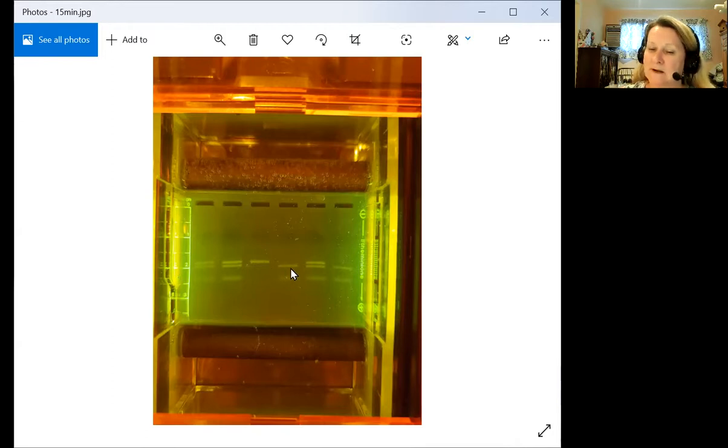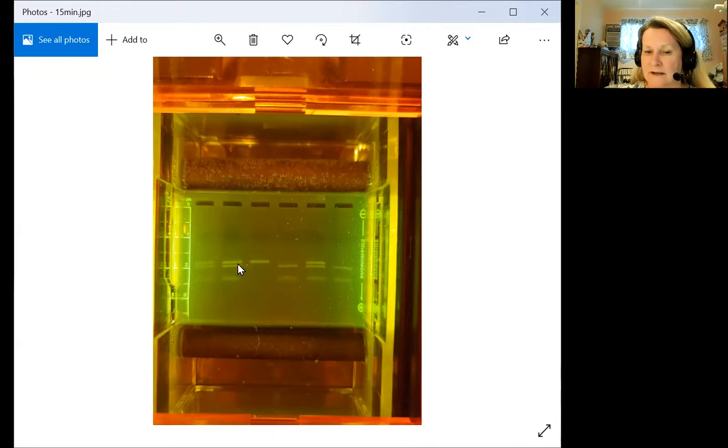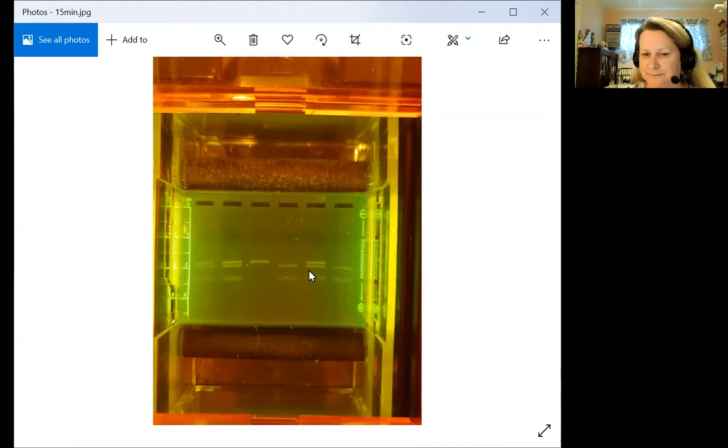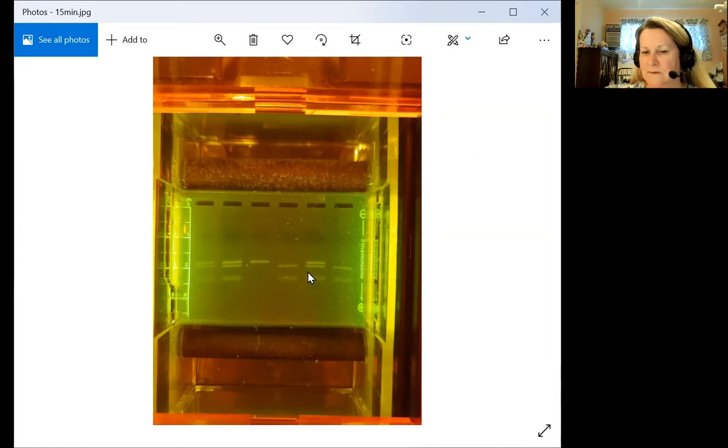Because he's a taster, he must be homozygous dominant. So the dominant allele is the smaller allele that runs further down the gel. Here's brother number two. What would his phenotype be? That's right, because he has two bands he must be heterozygous just like his parents.